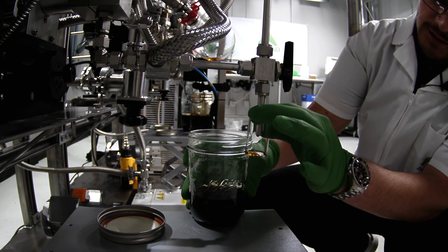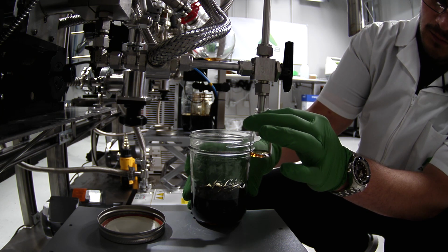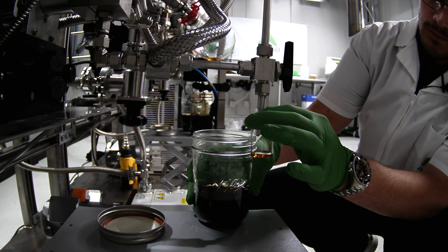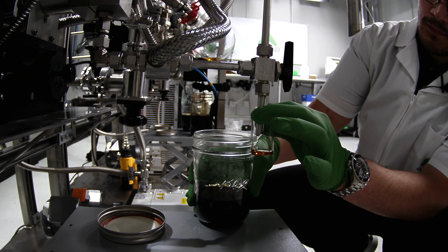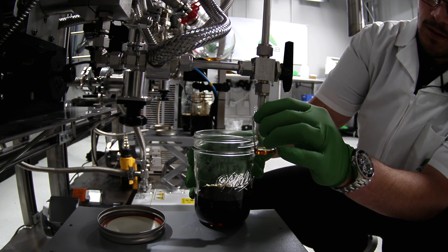Maybe a bit less though, it's dripping pretty slow here. Couple more drops here and I'll be ready to weigh.